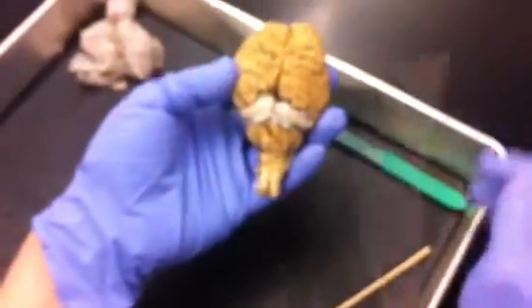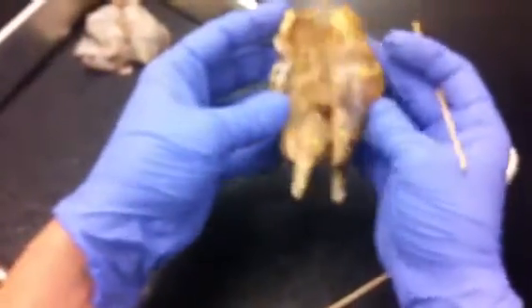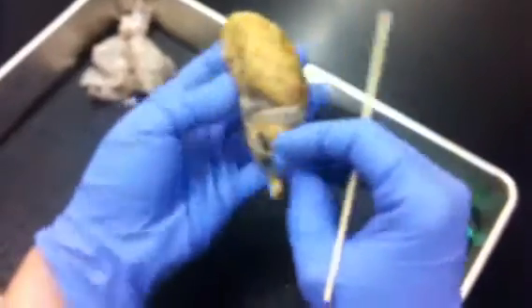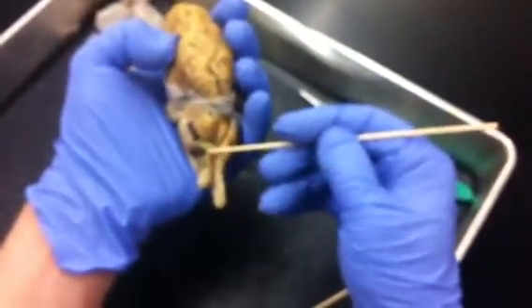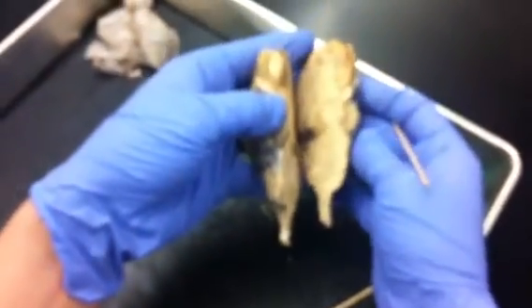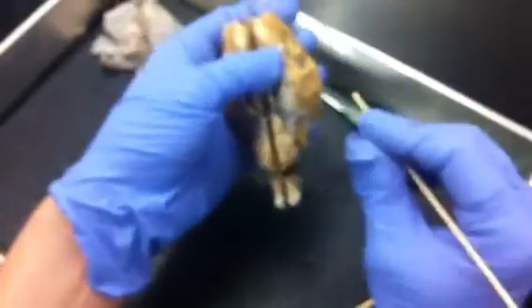Okay, can I ask you a question here? Other side? Yeah, because it looks like here you say this is the pons. Oh, it's actually deep down there. Let's see. This right here would still be medulla oblongata. Okay, actually, so the pons is always over there. Yeah, so just do it from this side. It'll be easier to see.